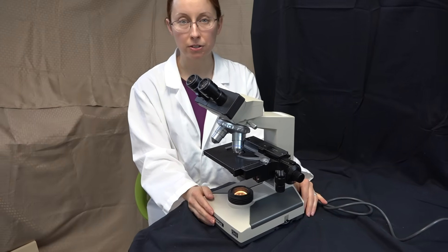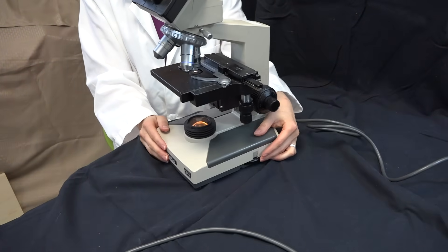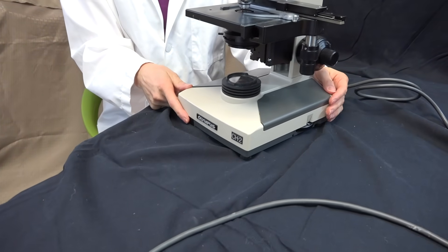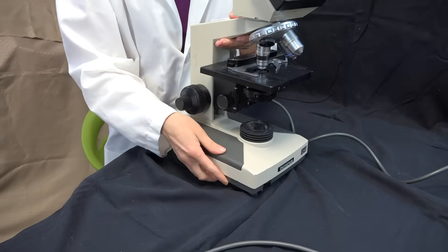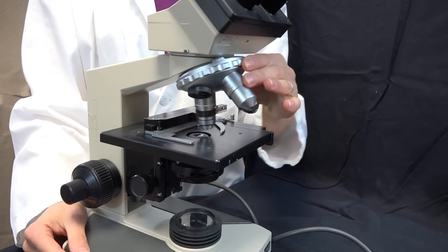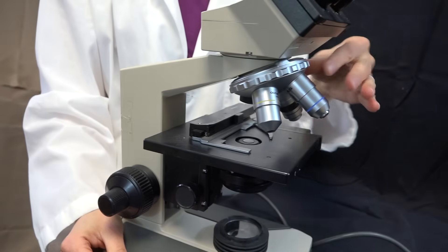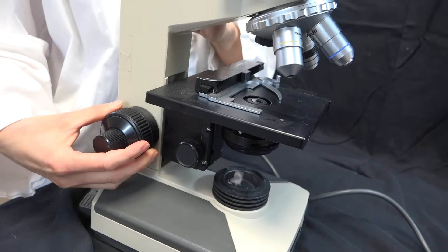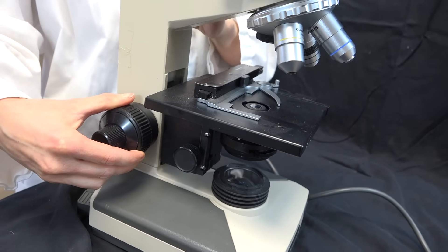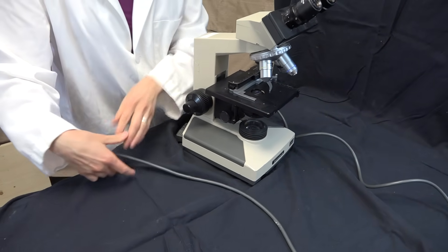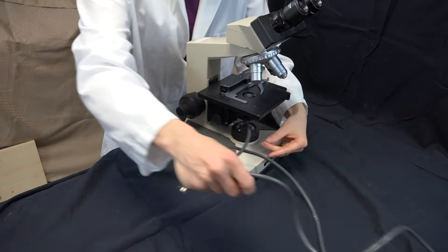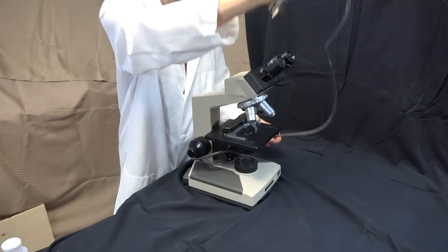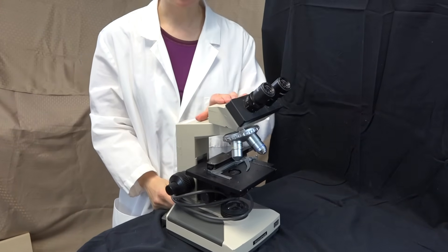To put the microscope away, begin by turning the light all the way down and then turn off the power. Then rotate the nose piece so that the low power objective is above the stage and lower the stage completely. Finally, wrap the power cord around the base of the microscope and around the arm. If your microscope has a dust cover, put that on.